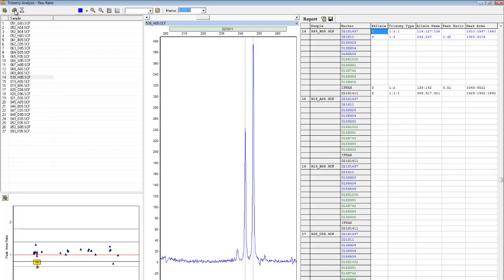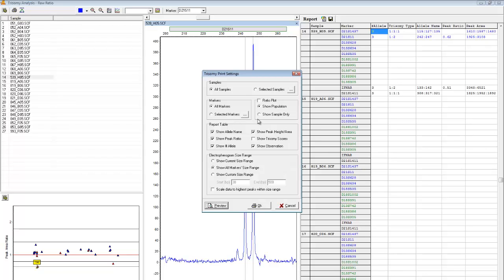To print this trisomy analysis report, just click on the printer icon in the upper left-hand corner. The Print Settings dialog box allows you to choose which samples and markers to include, and allows you to modify aspects of the ratio plot, report table, and electropherogram, all of which are included in the report. When you've made your selections, click Preview to view the report.